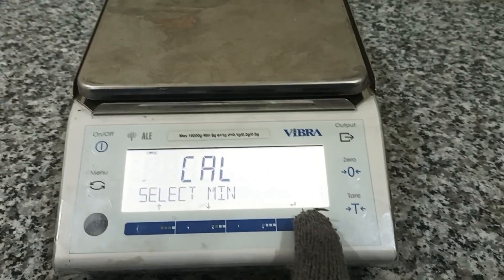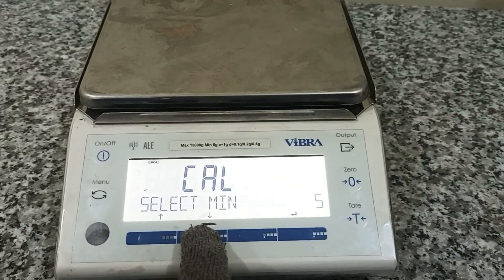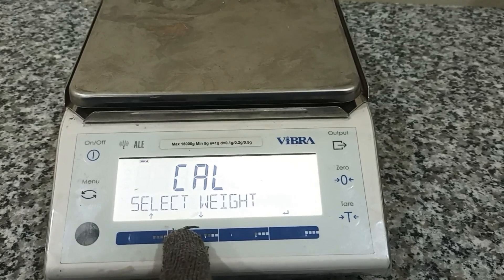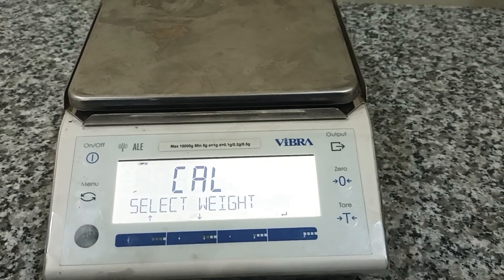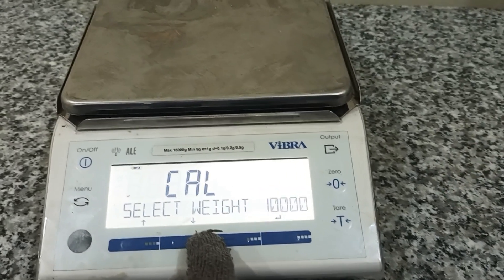I will select the capacity for calibration. This digit resolution — and this one is 150,000. The capacity is 10 kg. Okay, spread weight.